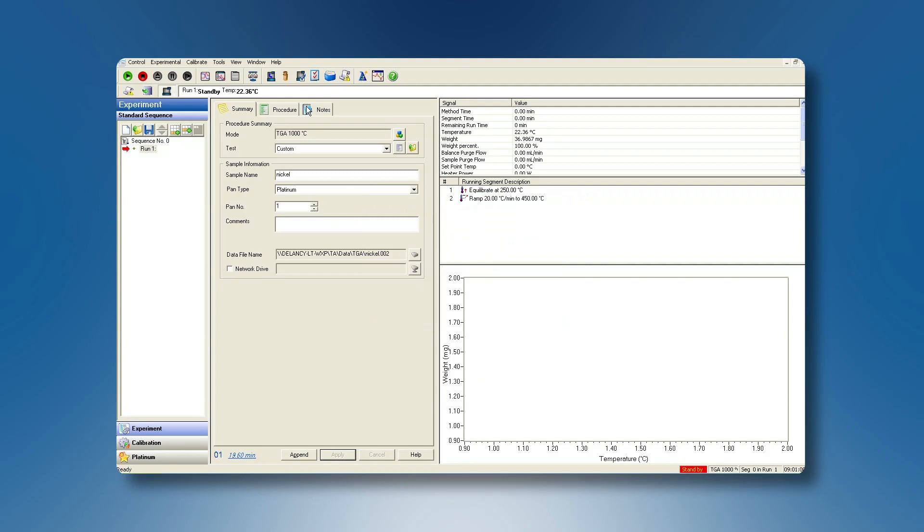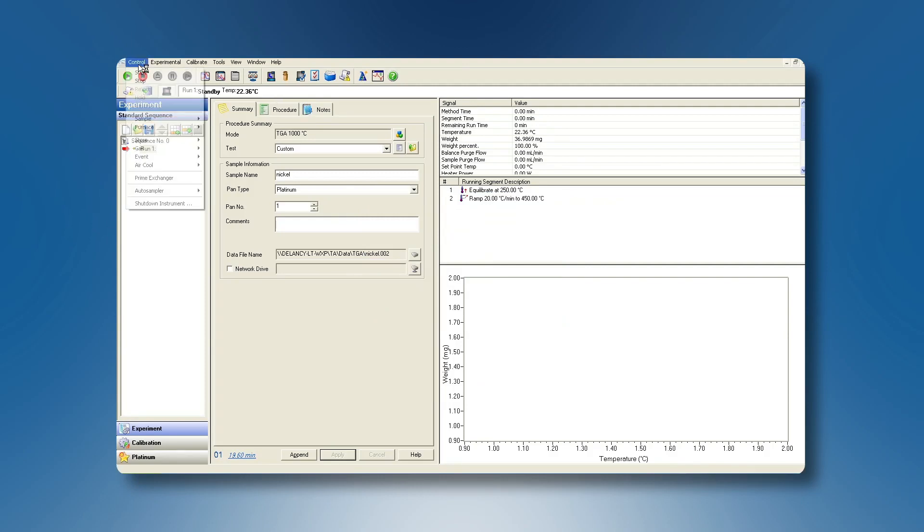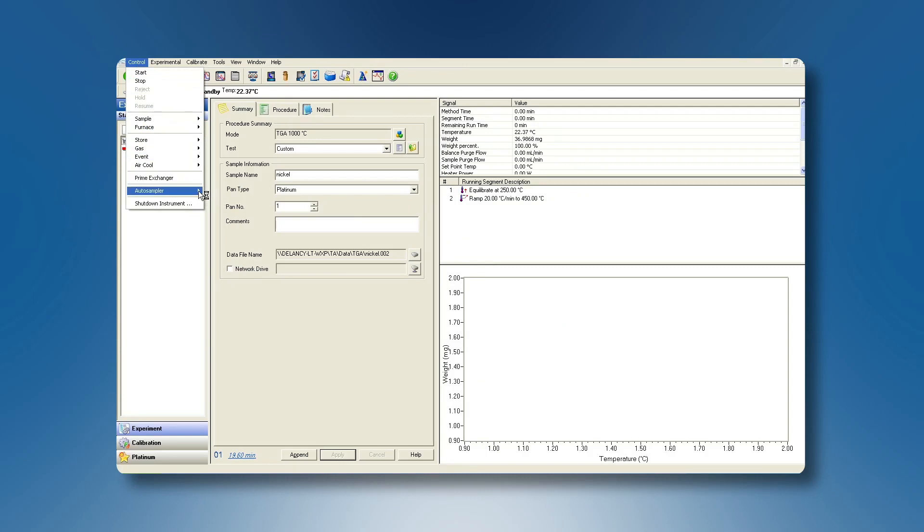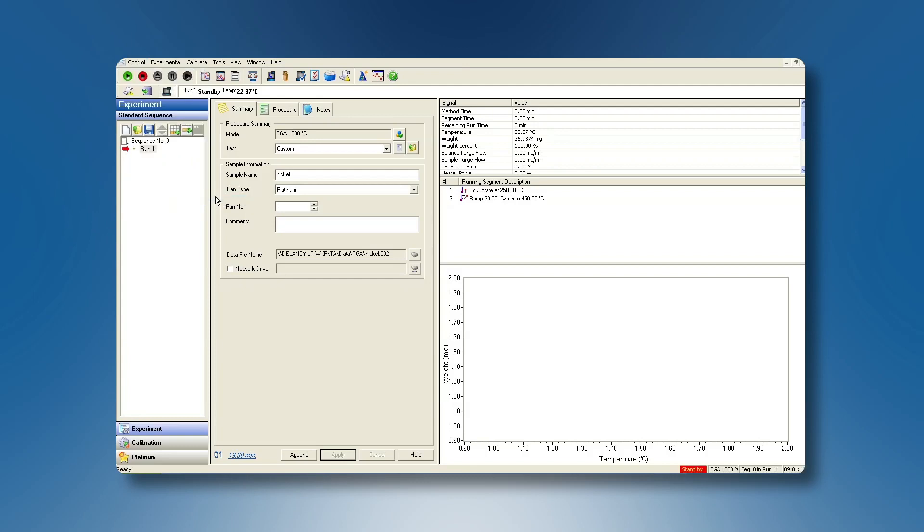Make sure that the TGA autosampler has been disabled. In Control, Autosampler, click on Enable Autosampler in order to disable it.